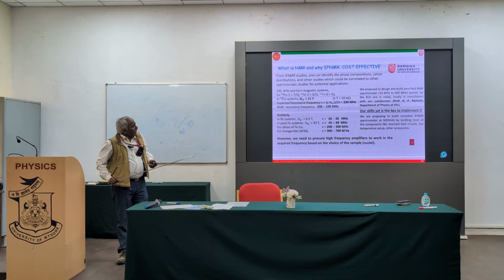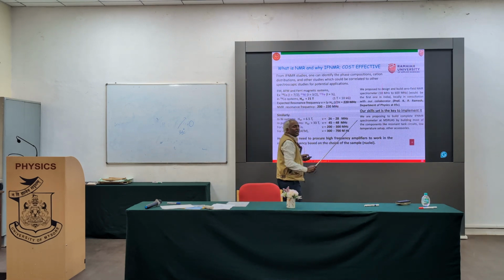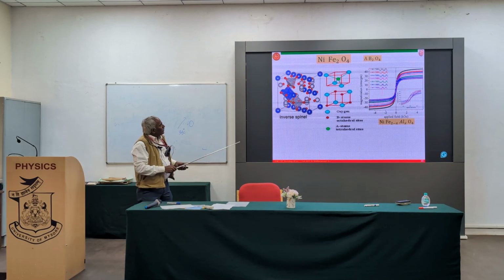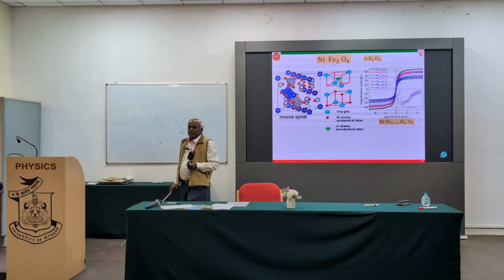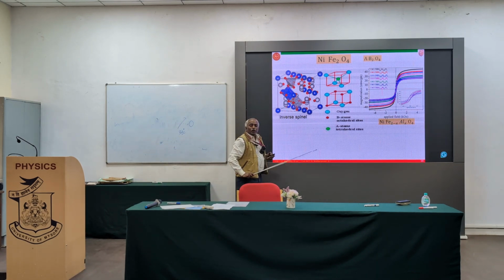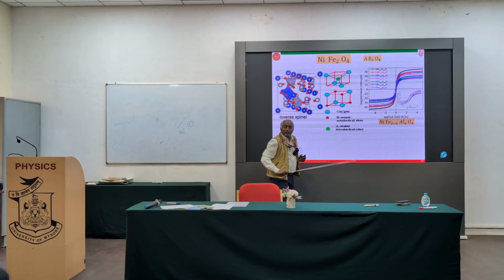And here, our skill set is the key for this kind of NMR to be done. Once you know that, the same nickel ferrite, talked about the iron, right? We will have nickel ferrite in the spinel ferrites, magnetic systems. Your iron can occupy 2 different locations. At nickel locations also it can go whenever I keep on changing the concentration of this iron, the way they started doping aluminum in place of iron.